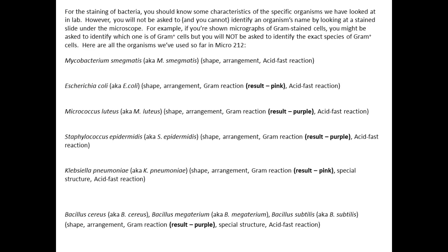You can't do that. And you guys will definitely know that after midterm when I give you an organism, right, that of course I know what it is, but you don't. When you're given the unknowns, you're going to run all these tests and stains to determine what it is, right? So you're going to take into account a whole bunch of information to be able to figure out which one you have. Okay? Make sense? At least that part will, hopefully, after midterm. It's fun. Students like it, it's like a mystery, right? Love trying to figure out what you got.